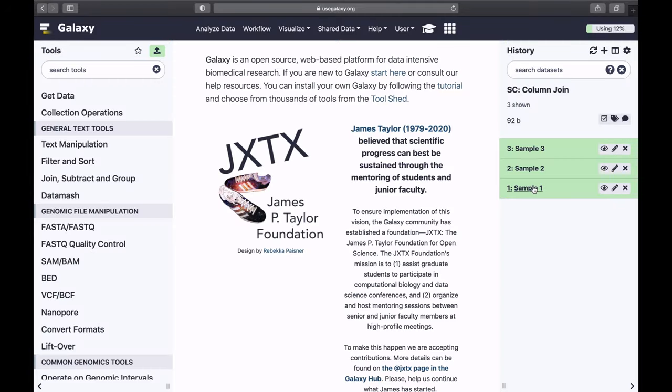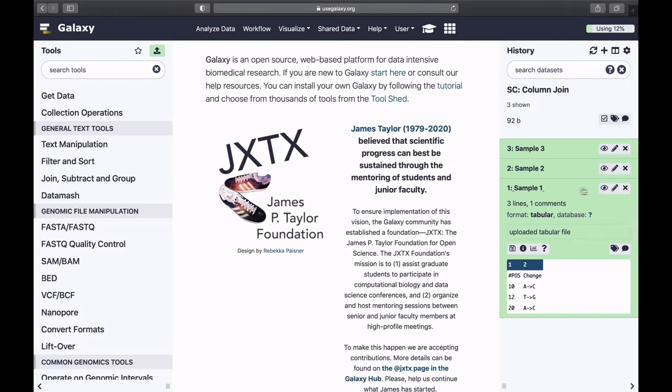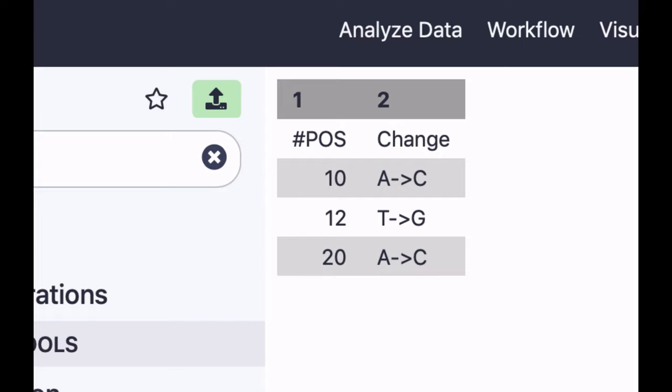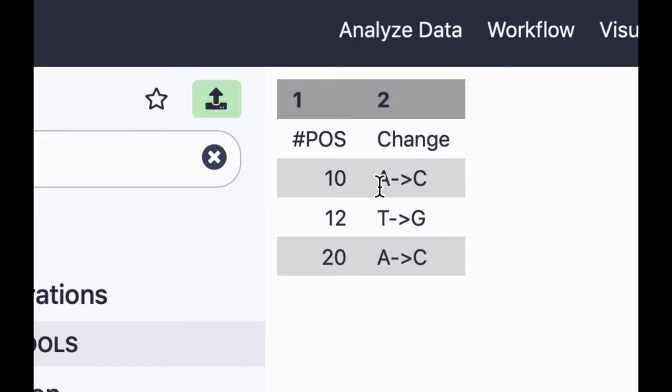Suppose you have three datasets and they represent changes in some genome. In the first dataset, these are your positions in the genome: nucleotide 10, 12, 20 and so on, and this is the type of change that you have in this sample.